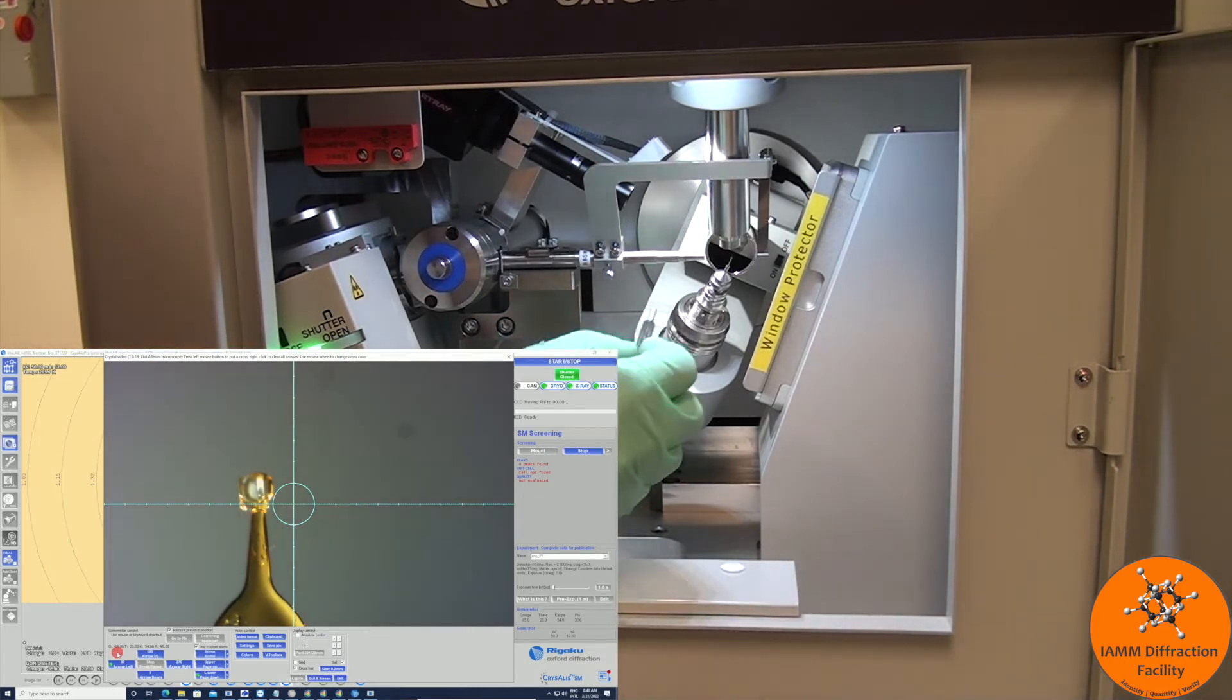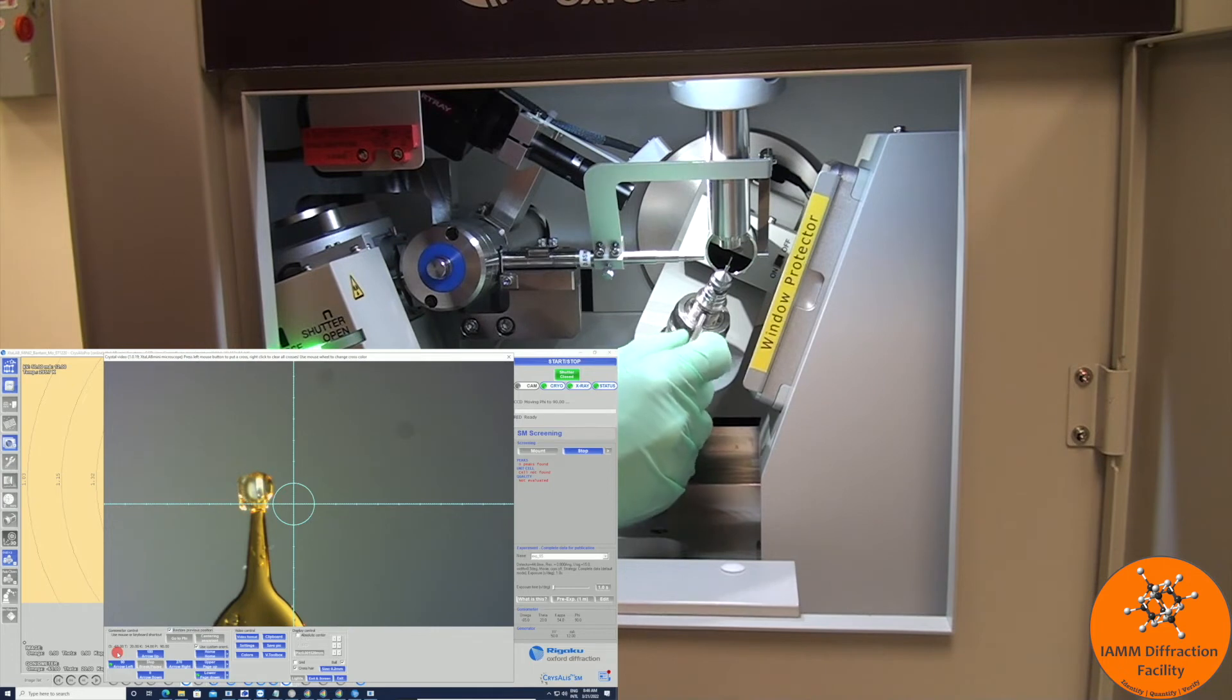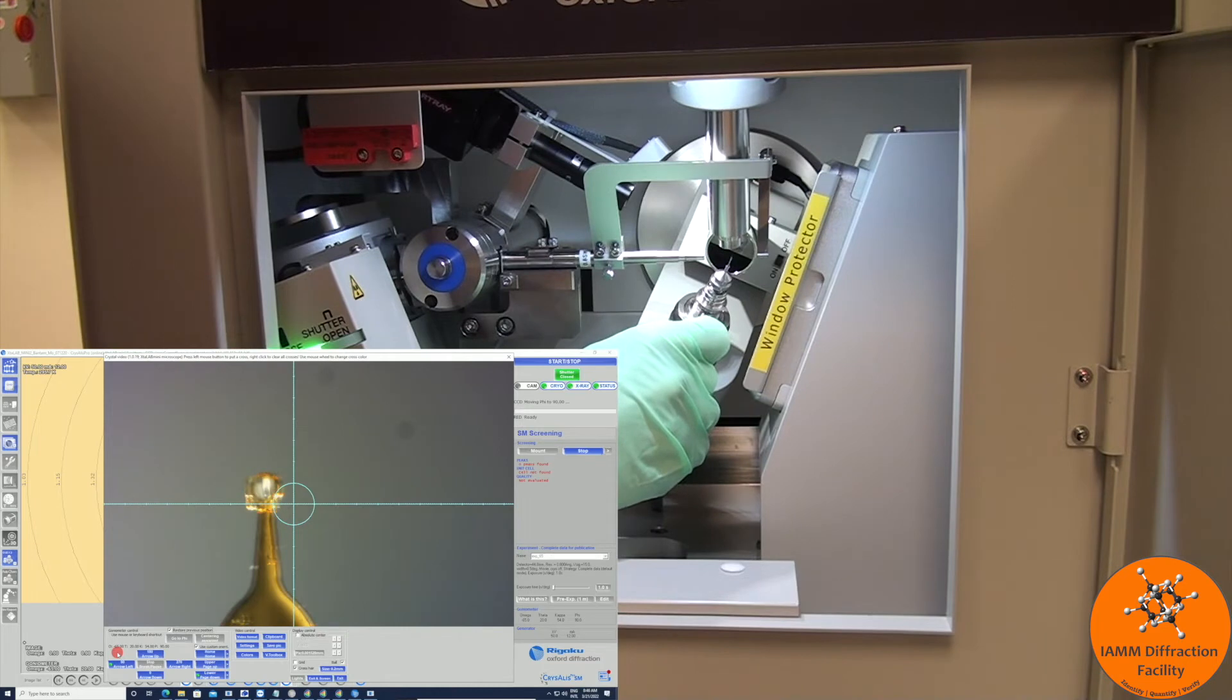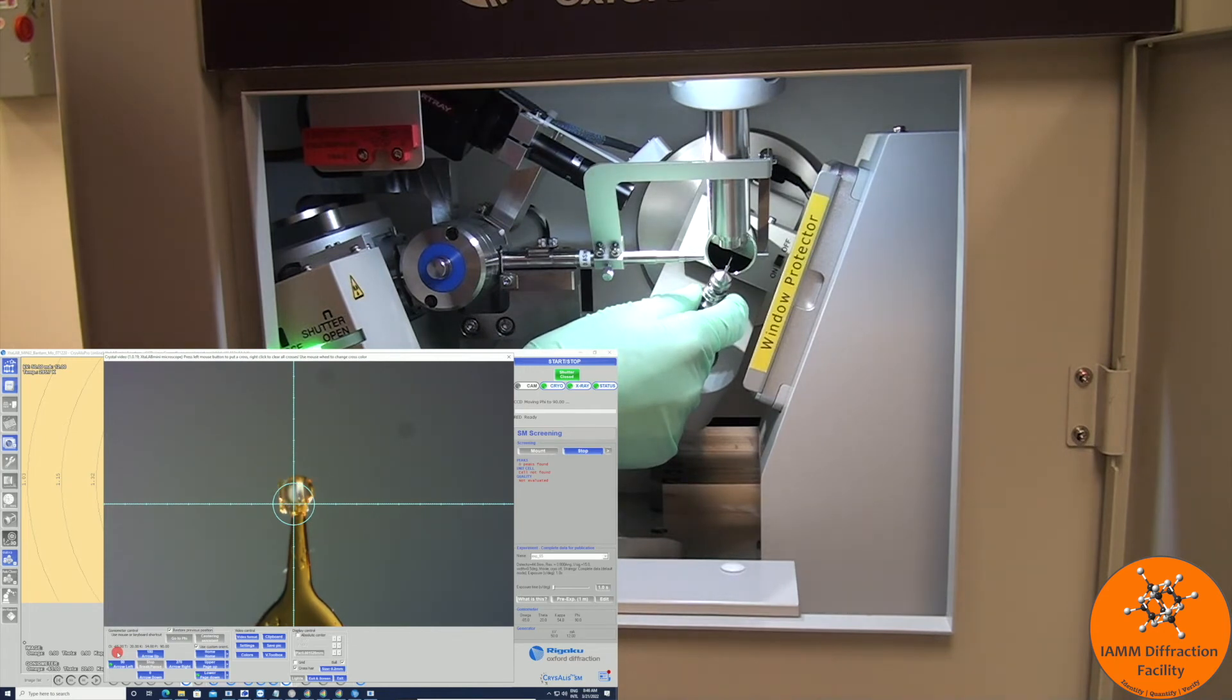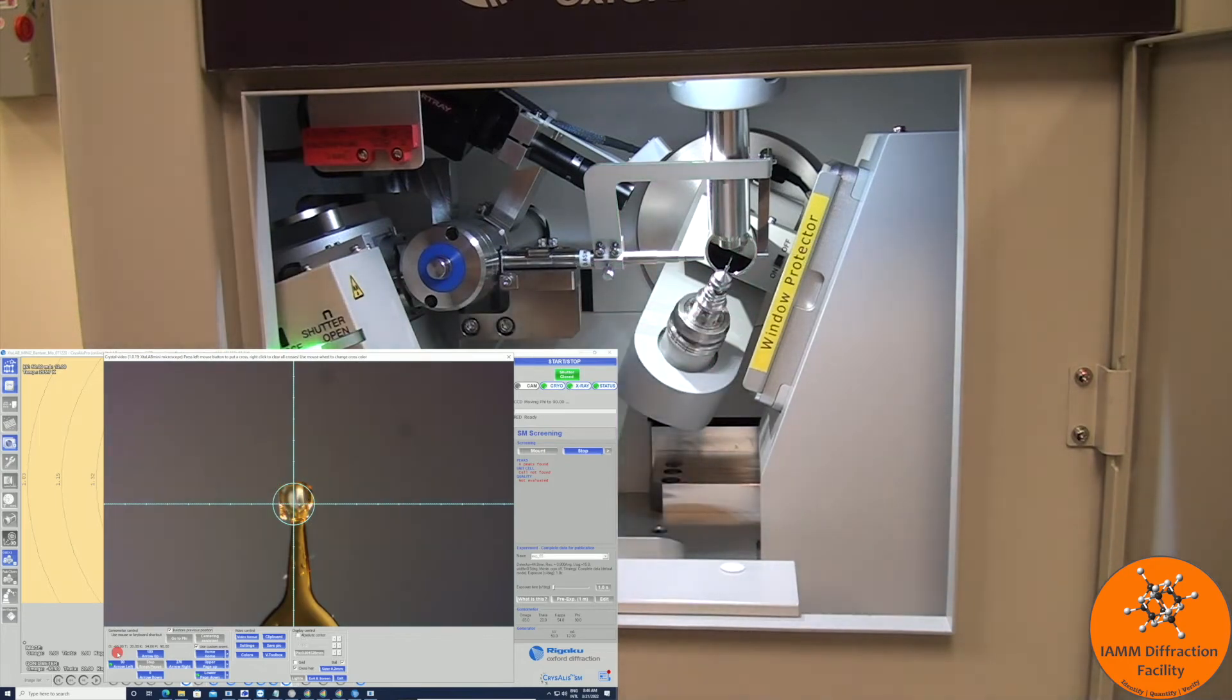So I will come back in here. We need to move the sample right this time. We also need to come down a little bit. That's looking pretty good.